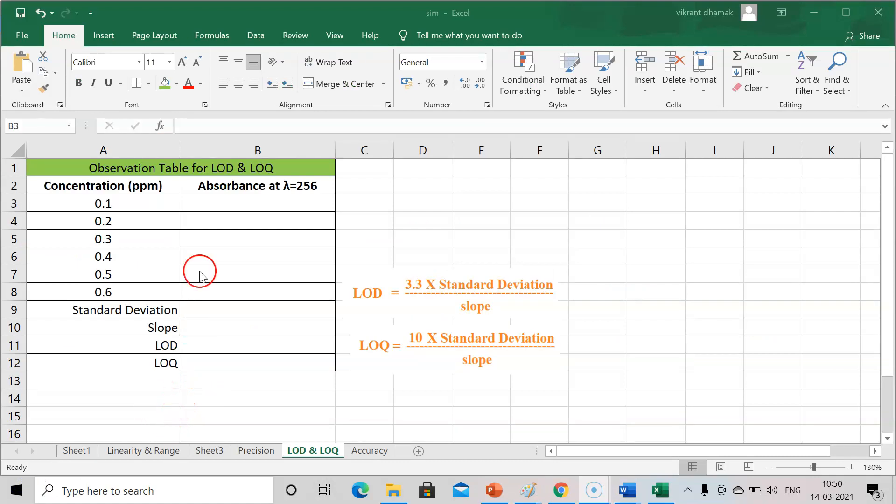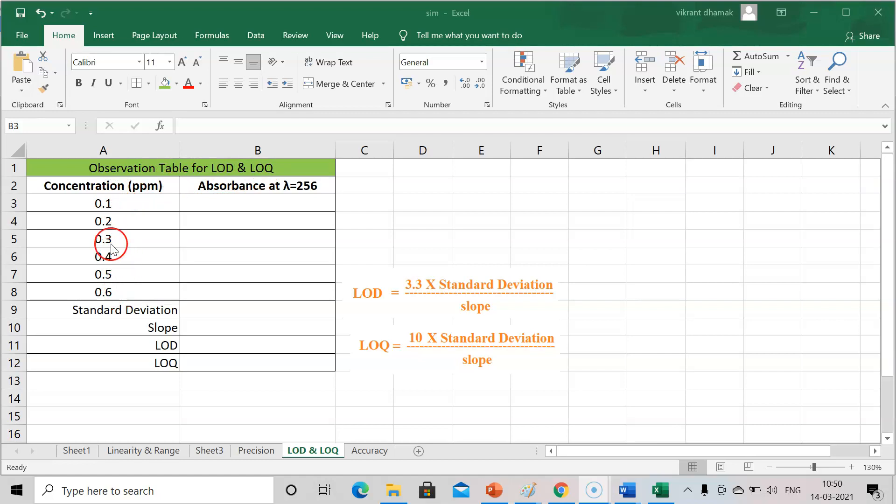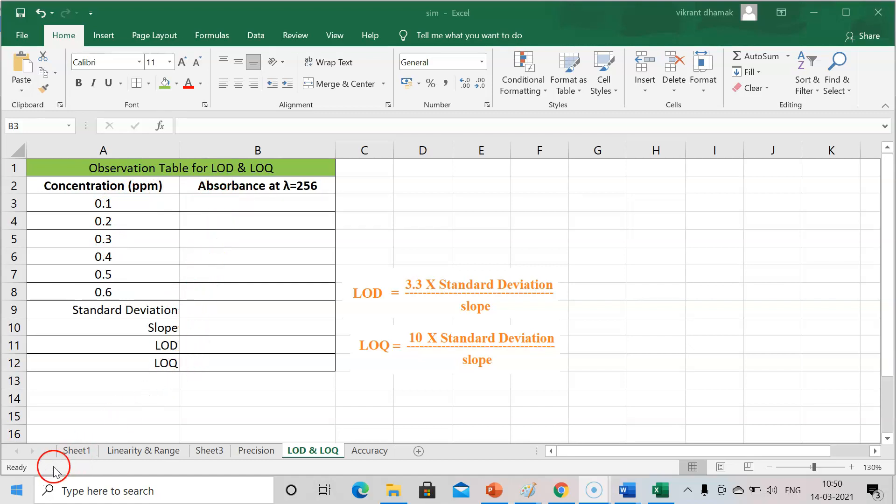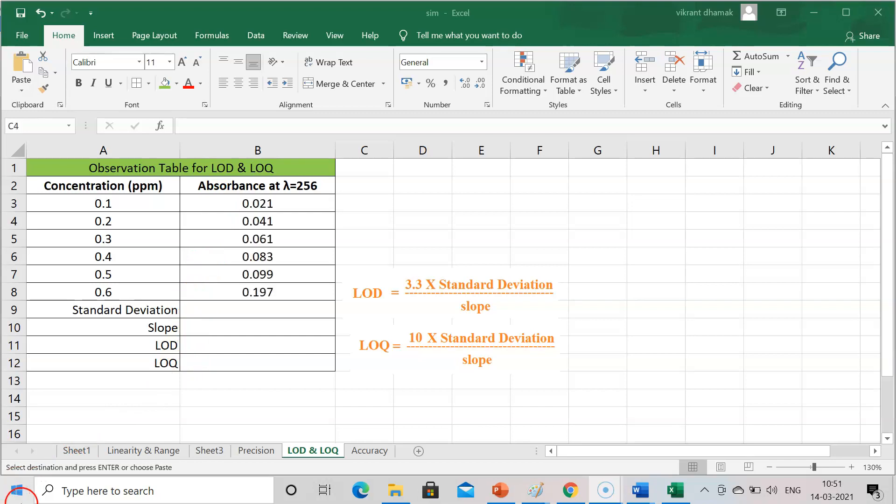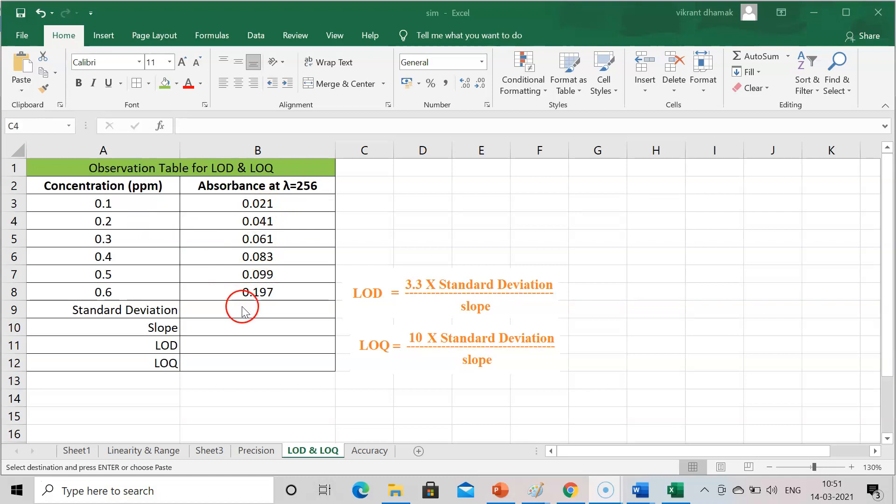Now we are in Microsoft Excel. This is the observation table for LOD and LOQ. These were the concentrations that we have prepared as per the procedure. Now we need to record absorbance and after that we will see all these parameters. After recording a spectrum I have got this value of absorbance at particular concentration.